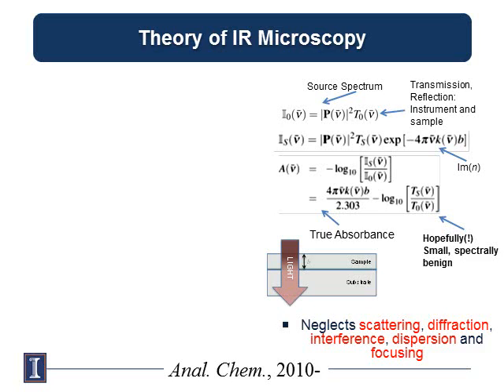If you think about it, what Beer's law tells you is that you have a cuvette of liquid, or something that is entirely non-scattering. Your light comes in at a right angle and goes through that material without scattering, without going out of your beam path. So that's what Beer's law says. If you look at the optical microscopy literature, what they tell you is light comes in, gets scattered once, the Born approximation, and then you collect that light and you deal with it. But no one tells you what happens when absorption and scattering happen at the same time. And that's really the crux of this issue.